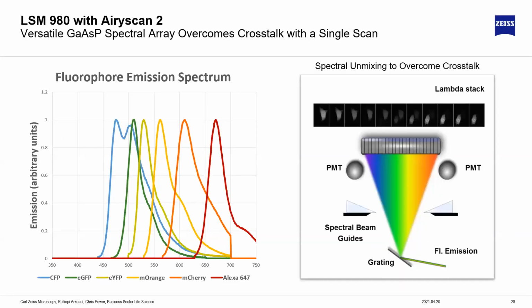So why is that very useful? As we discussed before, we have multiple fluorophores that are highly overlapping in their emission spectra. And therefore, as we are separating the light, you can plot individual fluorophores effectively onto the different parts of the lambda stack.